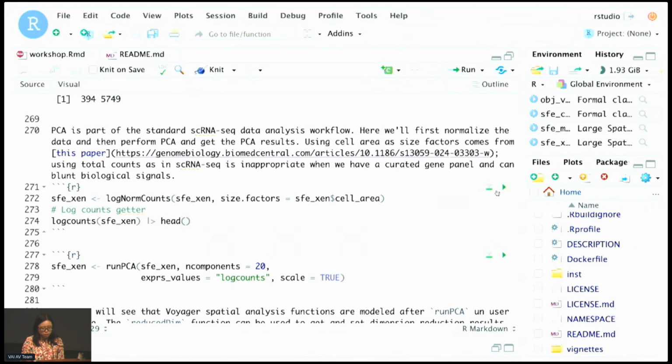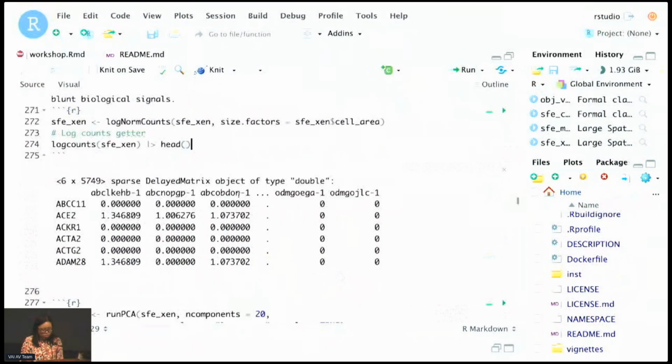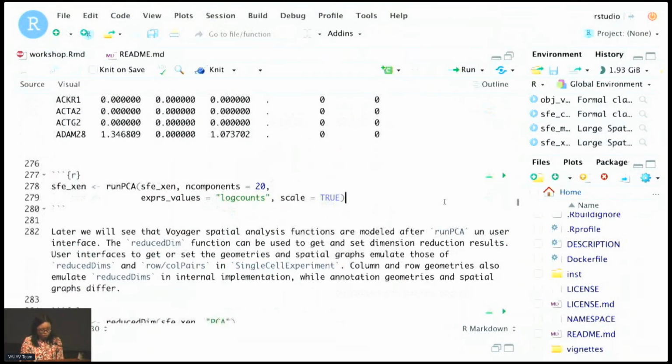It's not spatial yet. I do the data normalization, and after the log normalization, the logcounts getter from SCE can be used to retrieve or set the log normalized count matrix. Then we can use runPCA from scater and from BiocSingular. It's already part of the SCE ecosystem.